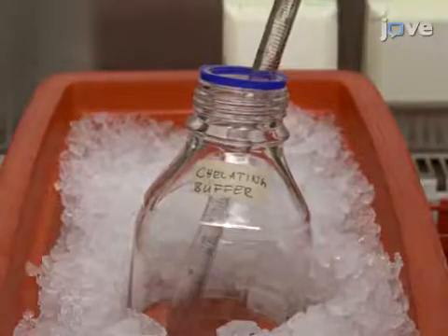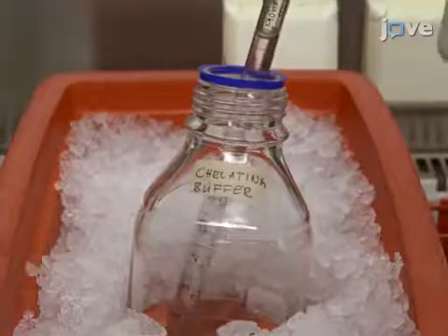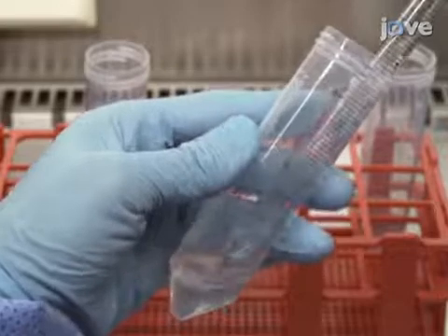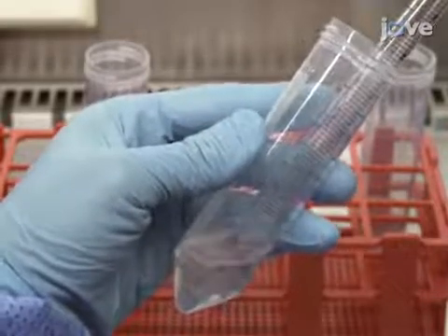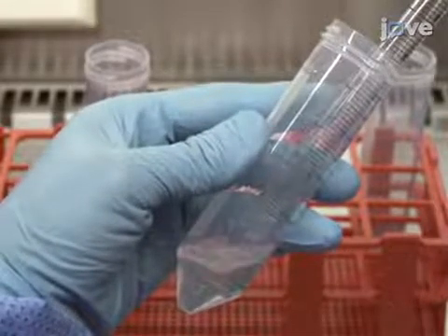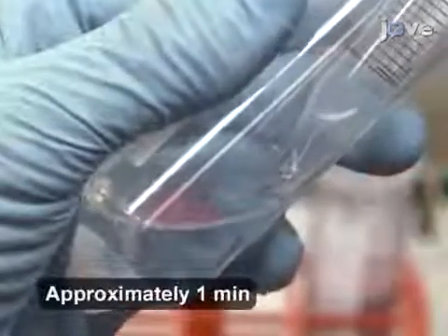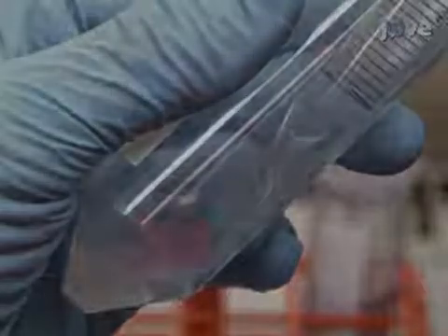After wetting a 10 milliliter pipette with chelating buffer, add 10 milliliters of the buffer to the 50 milliliter tube and wash the pieces by vigorously pipetting up and down 10 times. Allow the pieces to settle and remove the supernatant.